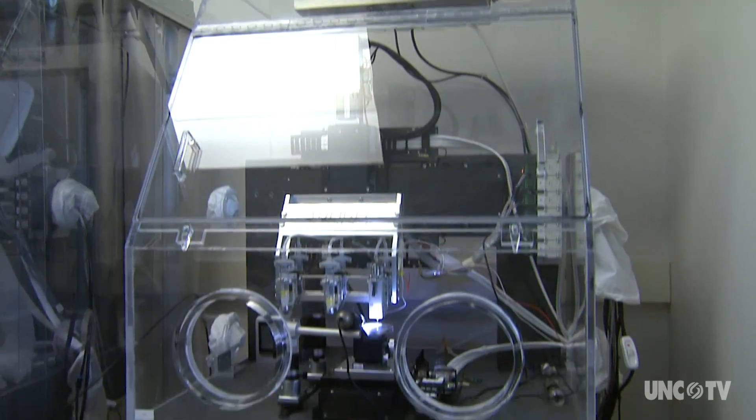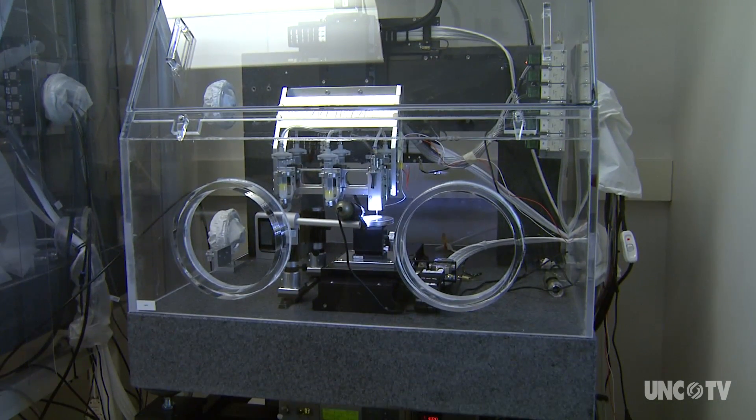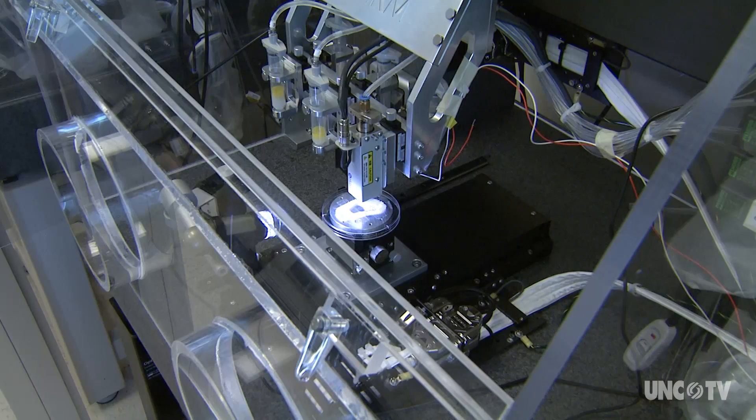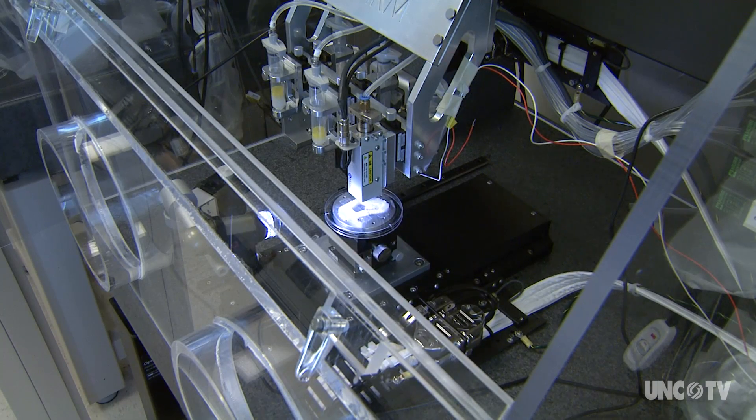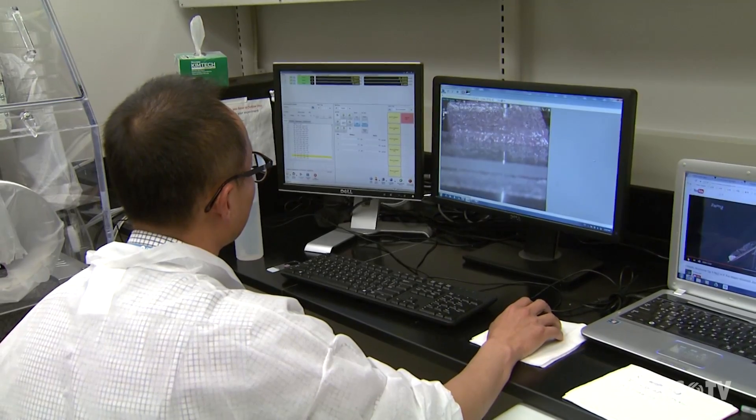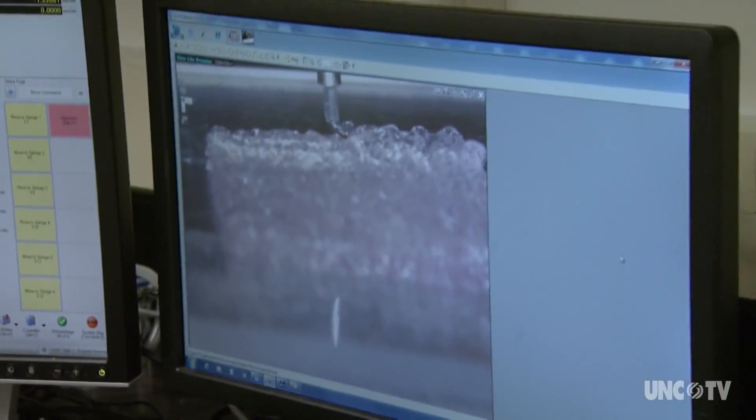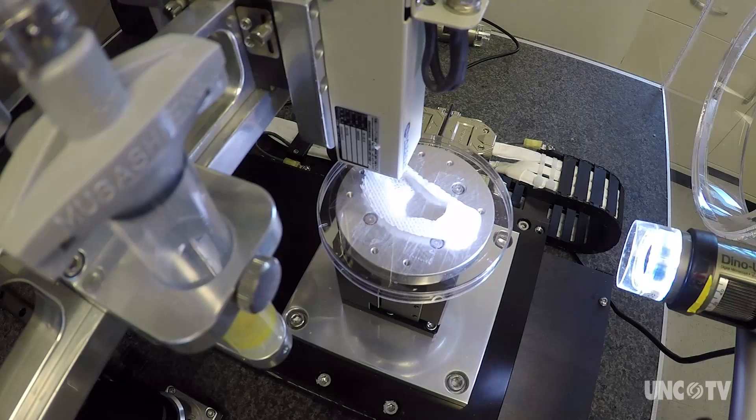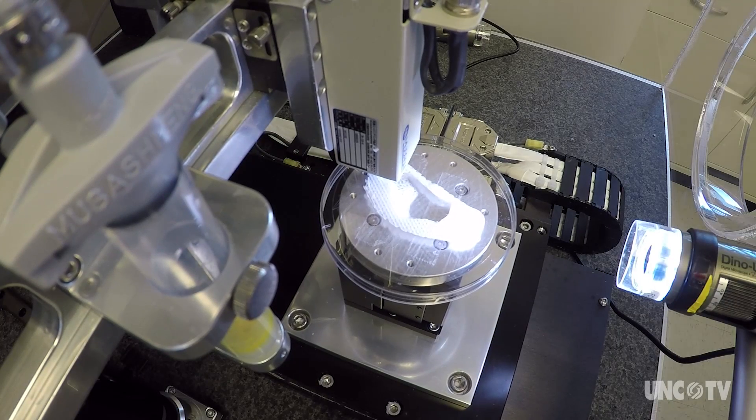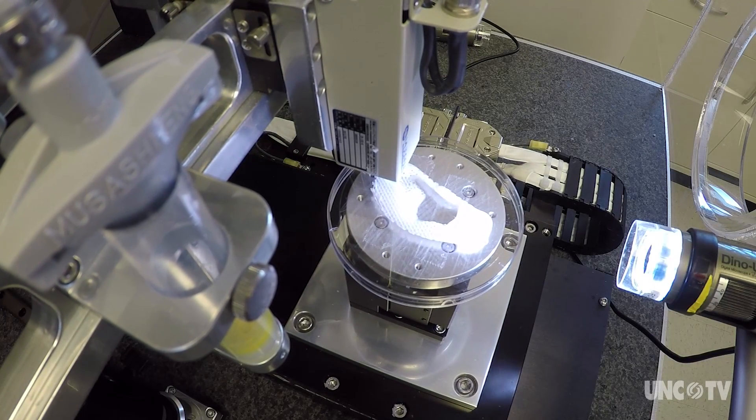And in the back of the lab there's a machine that looks pretty much like the standard 3D printer. Lots of ink reservoirs and nozzles, a computer to program what's printed, and an automated system that slowly builds a model, layer upon layer. However, this device is anything but your standard 3D printer.